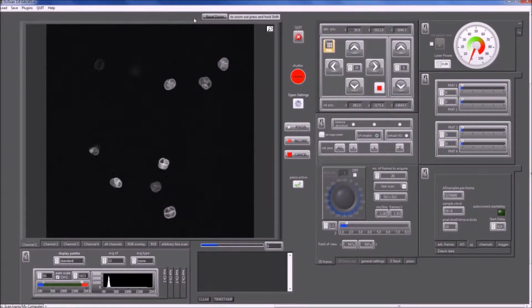To demonstrate the Position Save module, we have set up a Galvo system and will be imaging a pollen grain slide. This should work in the same way for a resonance system as well. In this video, it's assumed that the user is already familiar with using the SciScan software for multiphoton imaging. If not, you might want to watch the video which explains SciScan first.